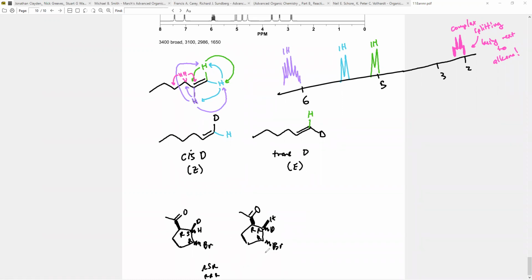Right, these are diastereomers of each other. So we can prove with the switch rule that these are diastereomeric. But you can also just think about chemical environment, right? So if I were to think about a cyclopentane, it tends to be envelope, right? It tends to be envelope.